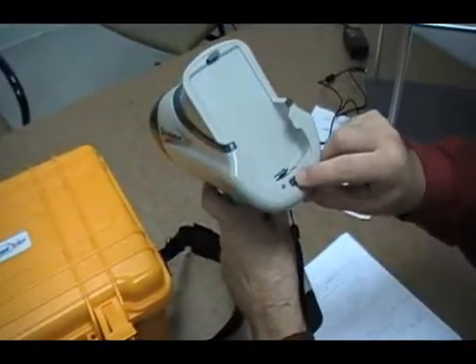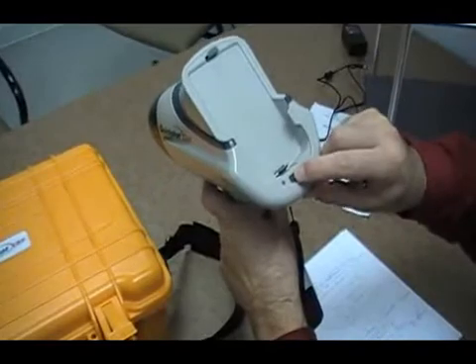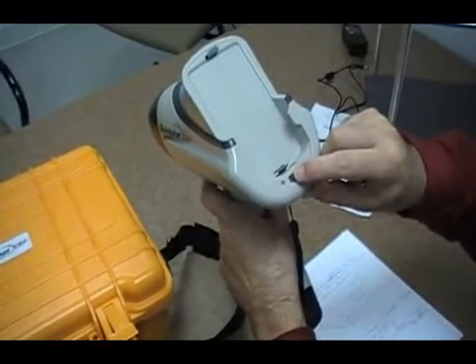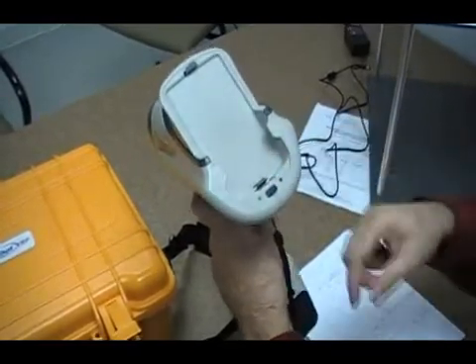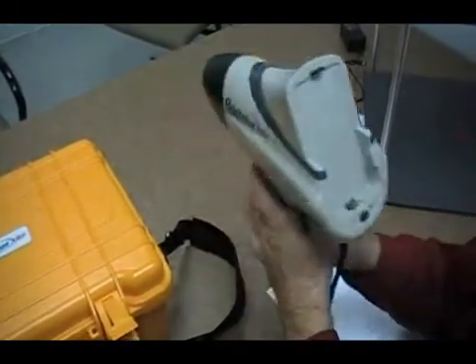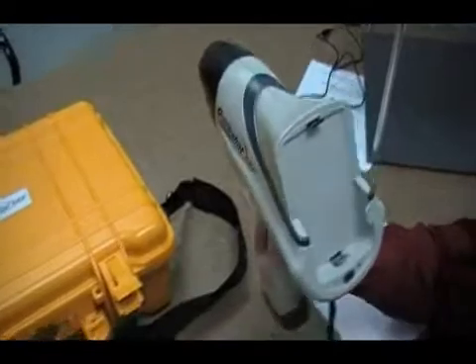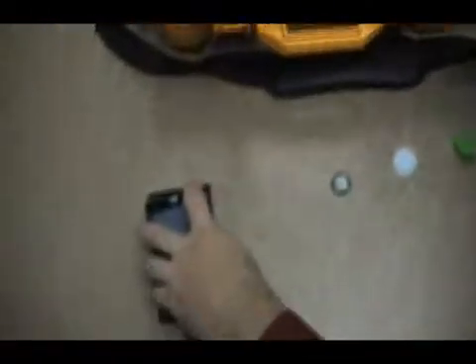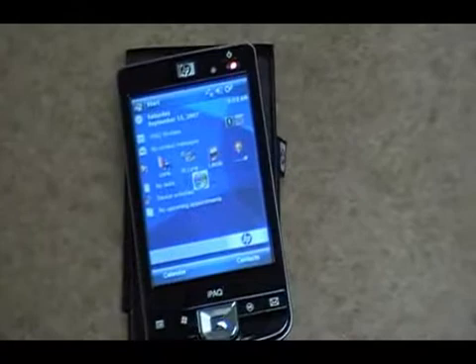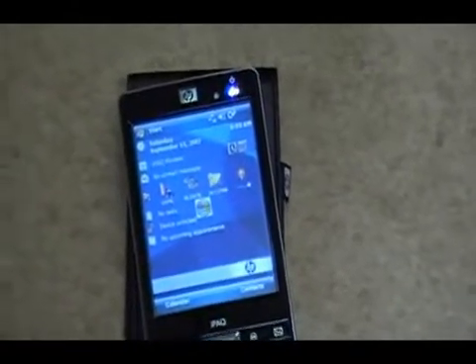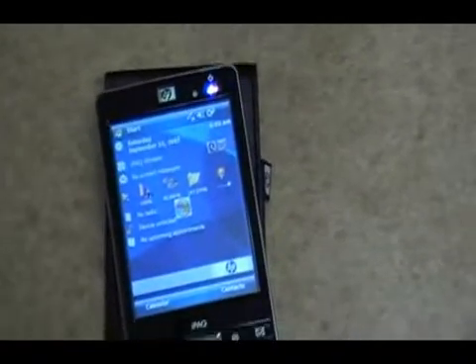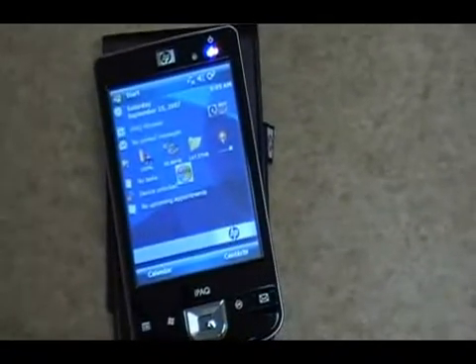You would first turn it on. You depress the button for about three seconds. The green light would come on. You then turn the PDA on. It's also included as one of the accessories to the handheld unit. You would go to the start key once it fires up.